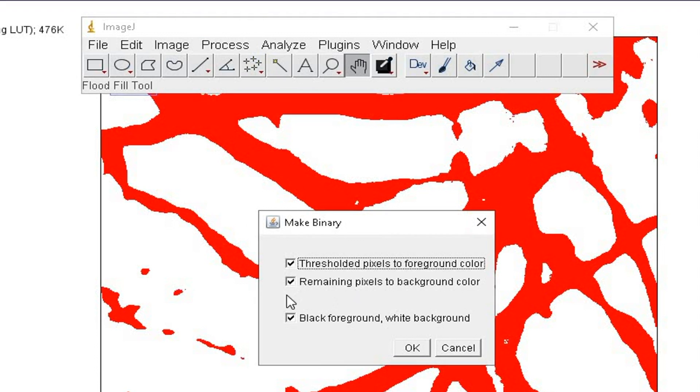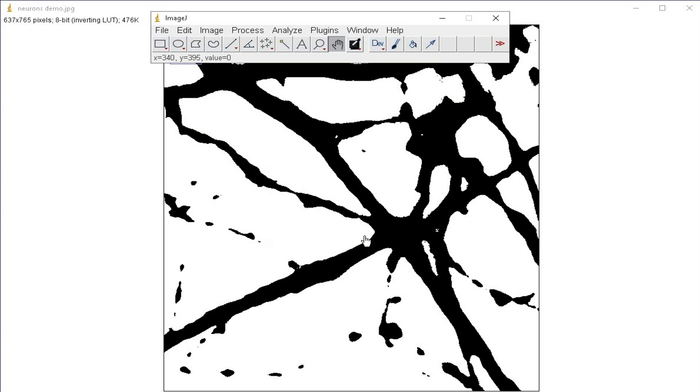Check on threshold pixel to foreground color, remaining pixel to background color, and black foreground white background, then click OK. The image is changed into black color in a white background.